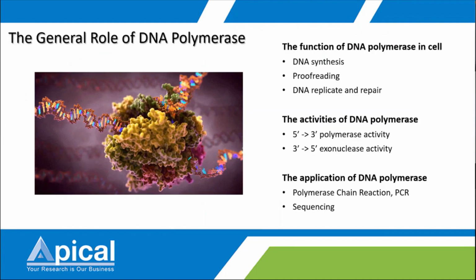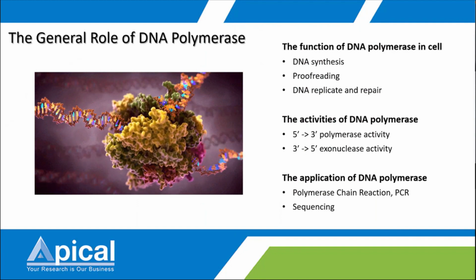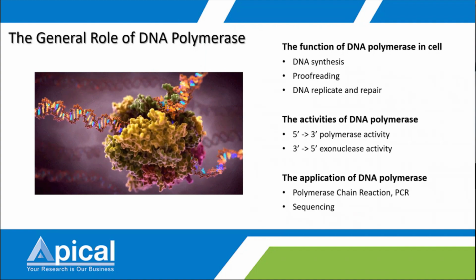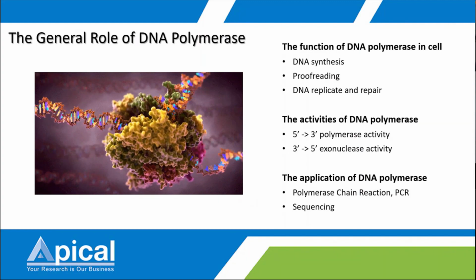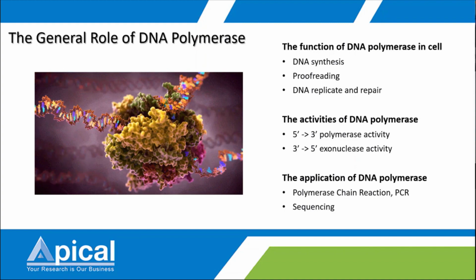So what is DNA polymerase? Generally, DNA polymerase is an enzyme that helps create new DNA molecules by adding nucleotides to a growing DNA strand. Its main functions include DNA synthesis, proofreading, and DNA replication and repair.